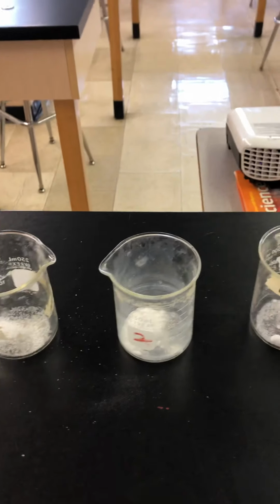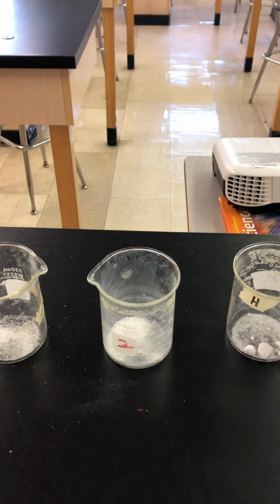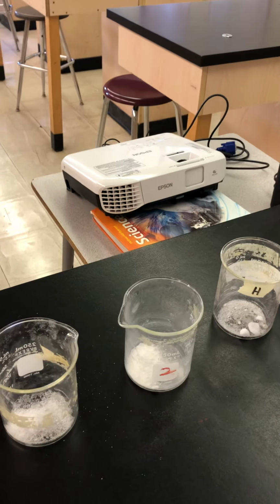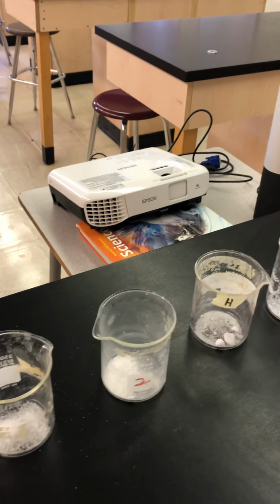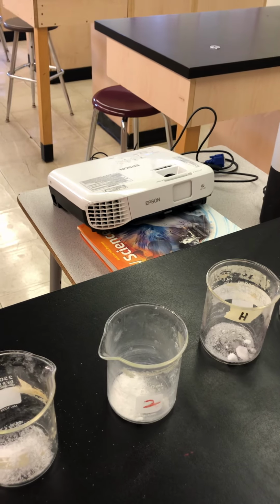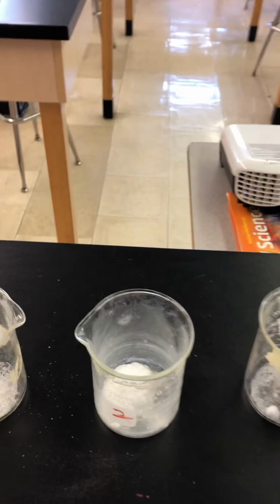We are going to be conducting experiment number 1 on page 47 in the resource booklet. This assessment will be going on the report card. So I want you to try your very best and make good observations. Okay, so what we're going to do is in front of me I have 5 different solids.